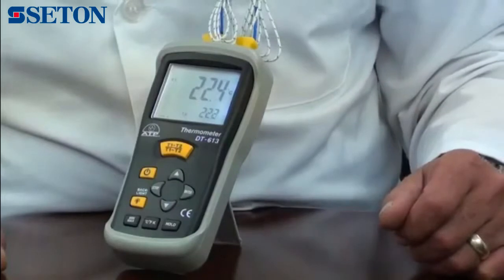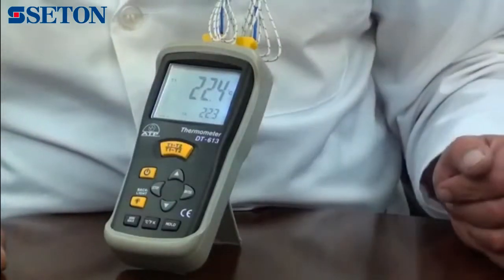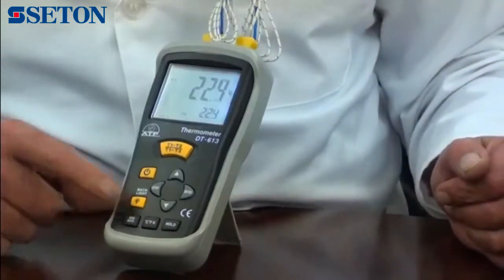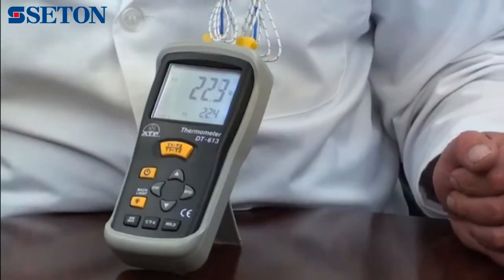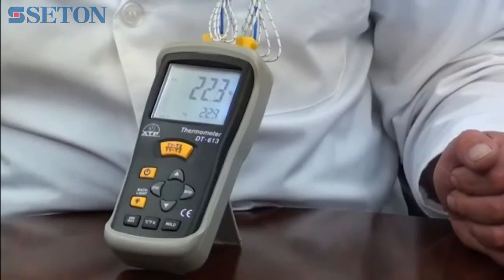When pressed, it will hold the display measured value, even if the probes are removed from the sample. A min-max memory is a feature that will display and hold the lowest and highest recorded value since power on or last reset. The thermometer also has an auto-power-off function and a low battery indicator.